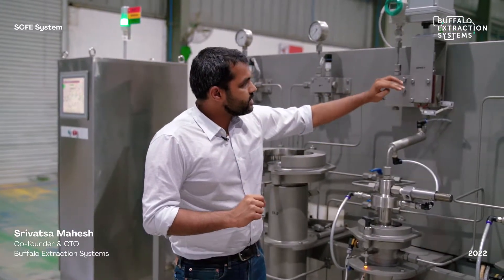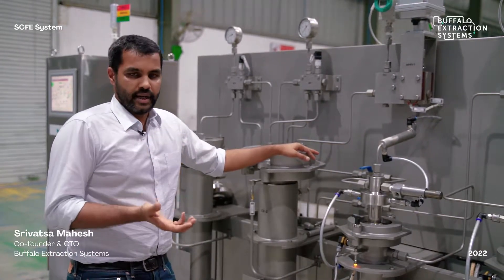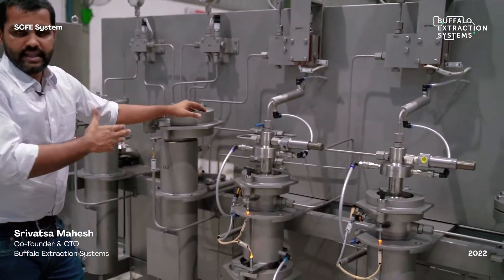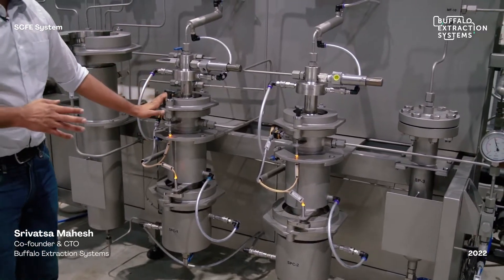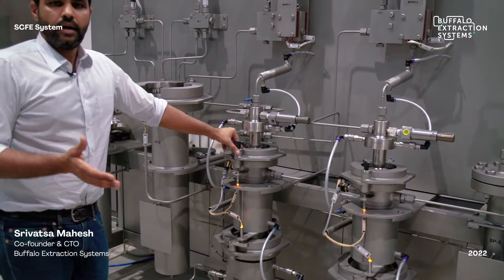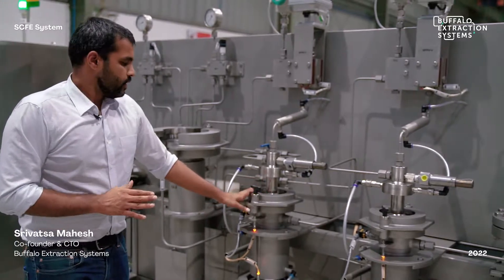Once it passes through the back pressure regulator, the CO2 depressurizes and you can have two fractions from the separators for fractional separation. The first separator can be kept anywhere between 60 bar up to 200 bar, and the second separator operates at a base pressure of about 60 bar absolute.